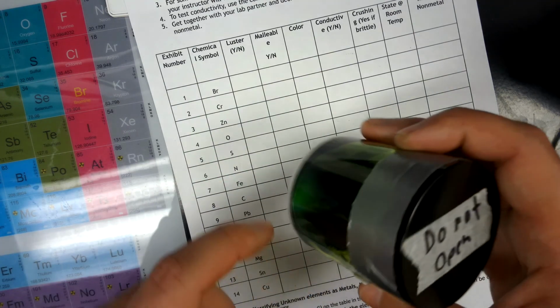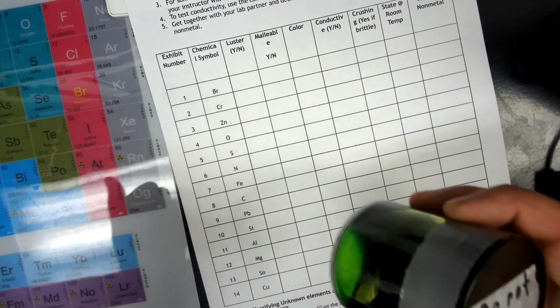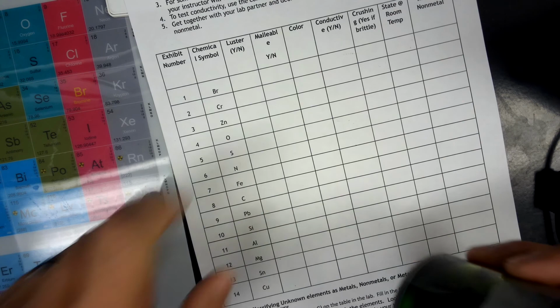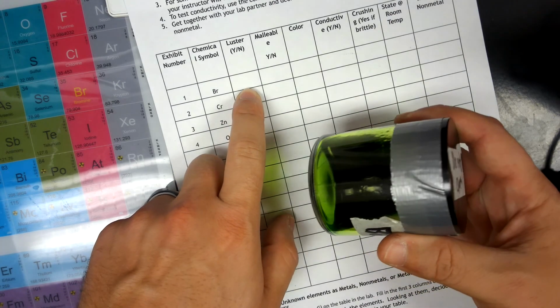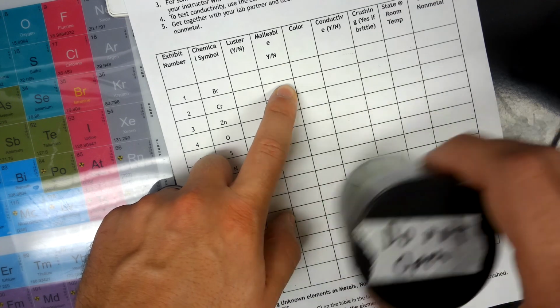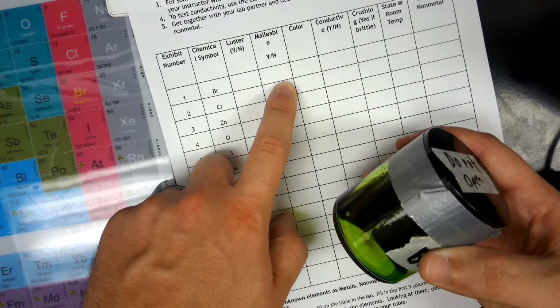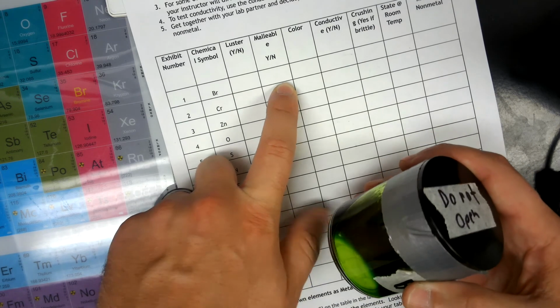Not fair since it is in liquid form. Some of this stuff isn't applicable. You'd have to get it in solid form to make it make a little bit more sense. Luster means shiny, and I would say that it's not shiny. It's a liquid, so let's just cross that out. Is it malleable? I mean, it squishes in your fingers, but no.